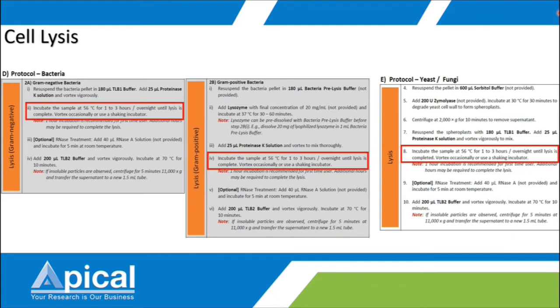So for DNA barcoding, because the gDNA will be used as a template for PCR, you actually do not need too high a gDNA content, because if it is too high, it can sometimes cause some unspecific amplification. So later on, if your gDNA content is too high, you still need to dilute it. Okay, so lysis of 1 hour should be sufficient for DNA barcoding application.